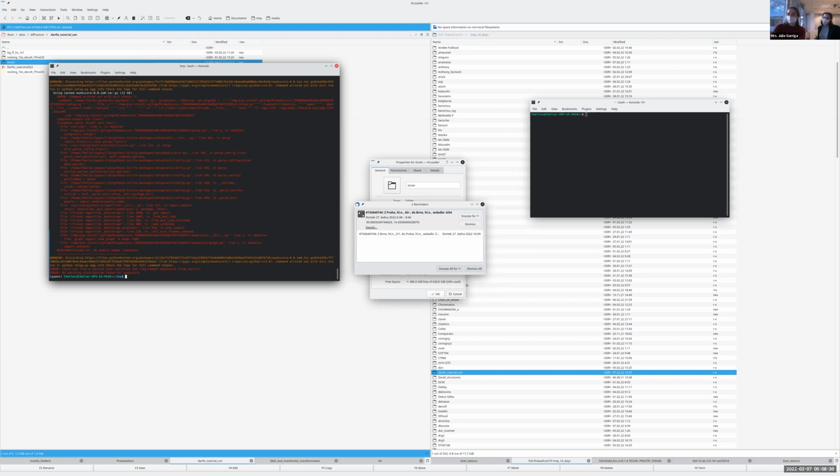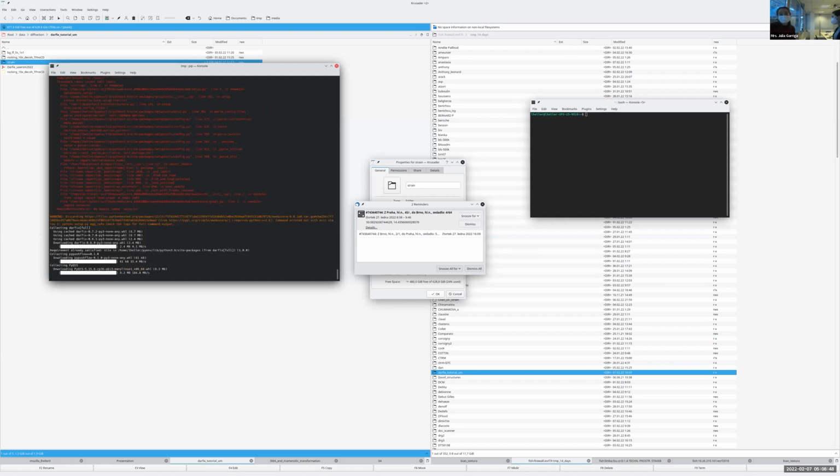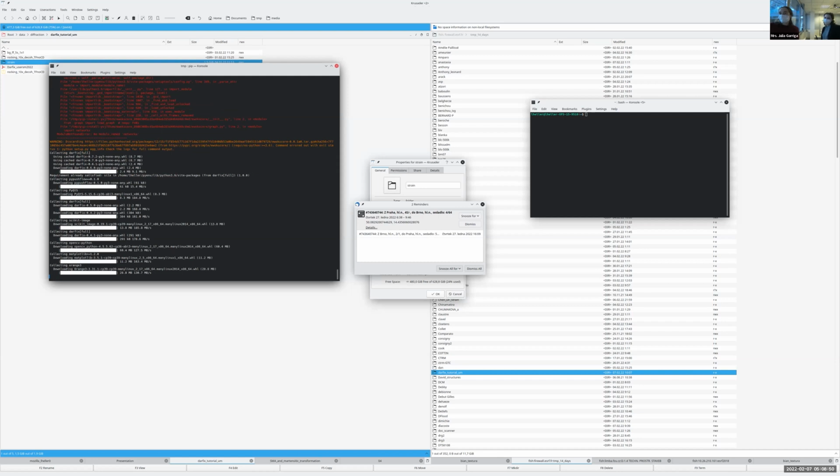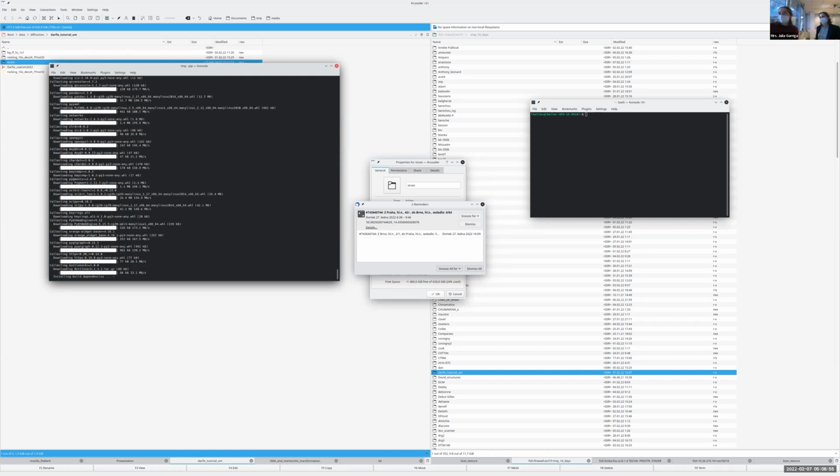I put you another one, and this I hope it works. I forgot the full, which will download all the dependencies. Let's see if that works. The workers are still on strike, but maybe this time it goes. Otherwise, if we put no cache, I think after this one you should try, because if it starts instantly, probably we can make it really complicated.